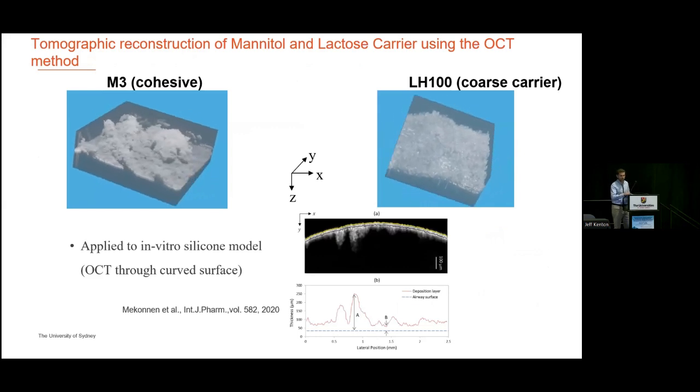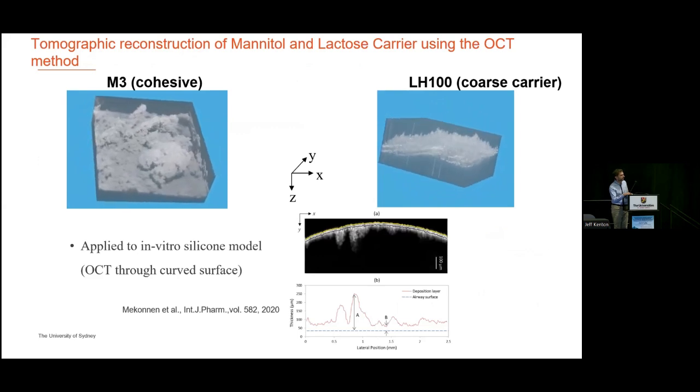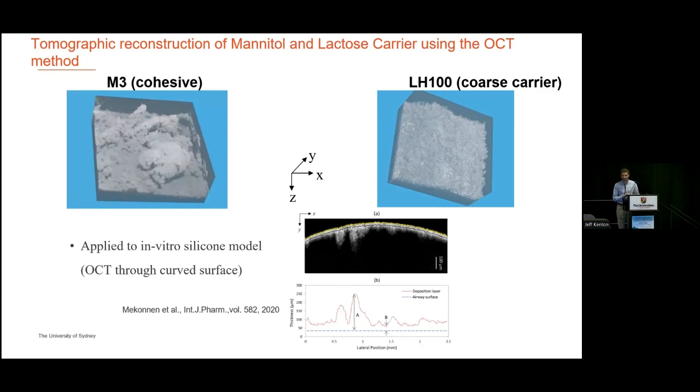So this is our more recent OCT technique where we've essentially expanded this so that it provides us more of a tomographic structure of a particle layer. These are measurements that you do in situ. So the OCT technique can be applied directly to the airway surface or to an aerosol. And what we're doing now is we're making this time resolved. If that's made time resolved successfully, it means that you can actually get a 3-dimensional map of deposition happening on an airway surface as the aerosol is flowing through that airway. The nice thing about this is that, as I mentioned, it is depth resolved.